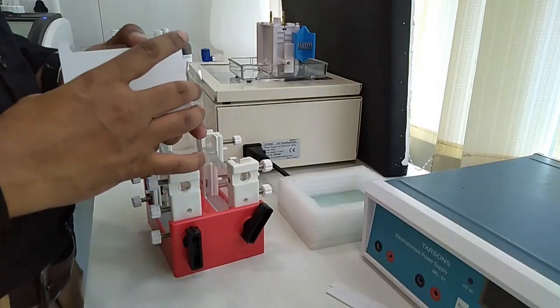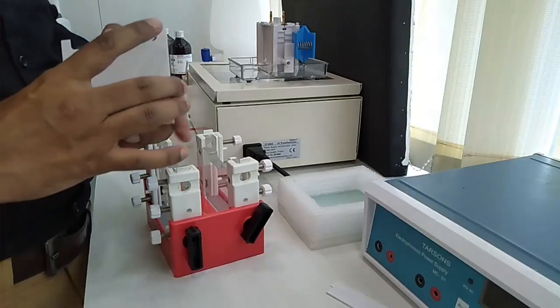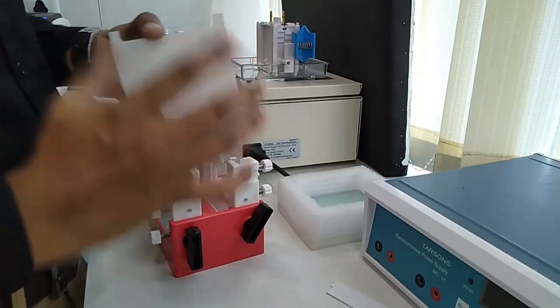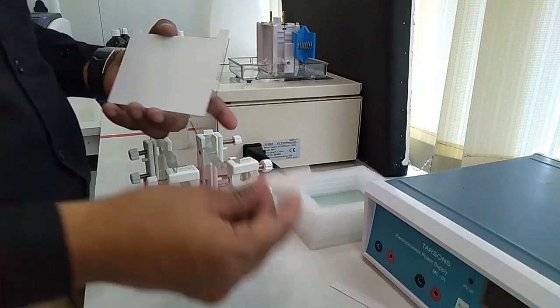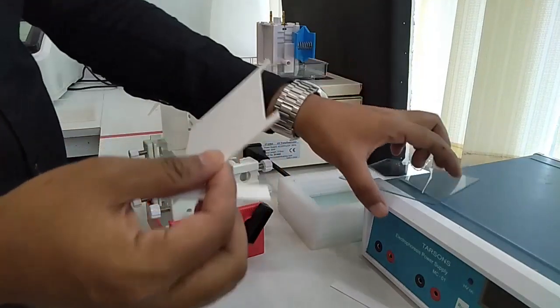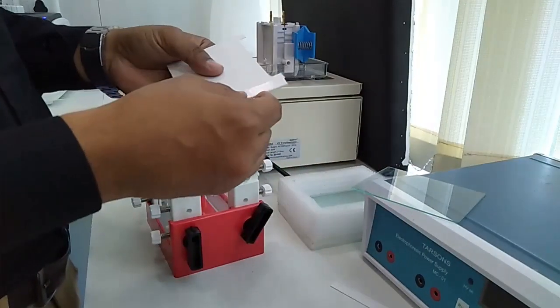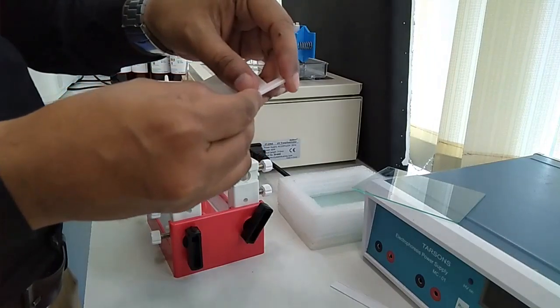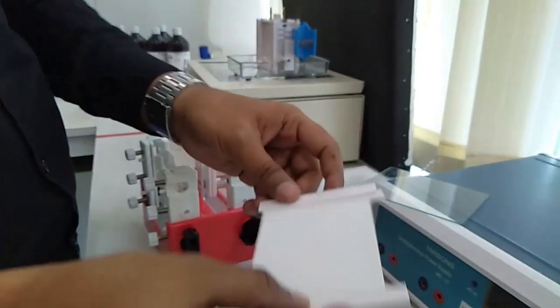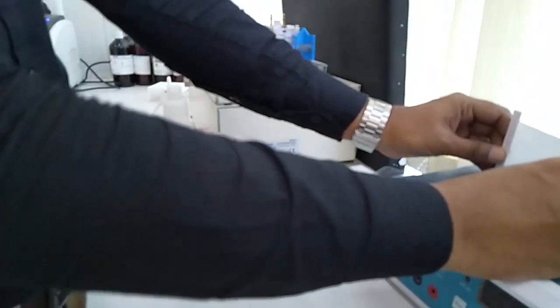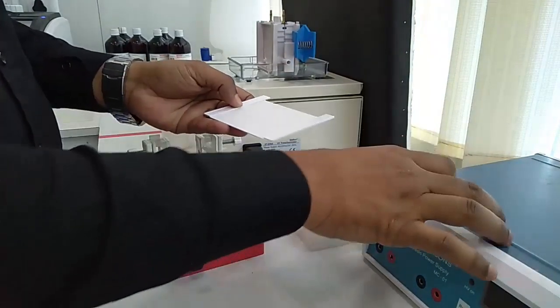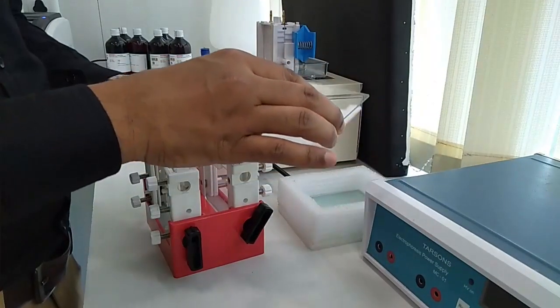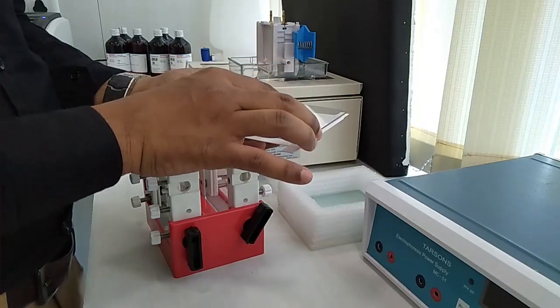Now we'll set the gel caster. So let's see how we'll set it. At first this white plate is taken and this is set up with two strips in both sides and the glass plate on the other side.